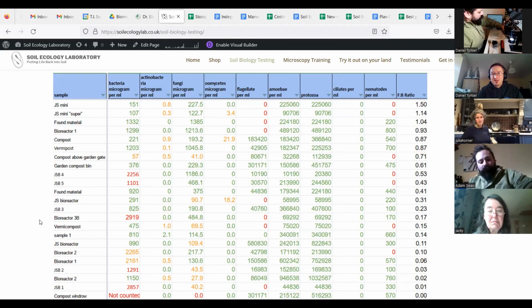And so here, using this microscope method, what we're measuring is that potential. It's not a direct calculation. It's not something that you can easily calculate and say that if you have this amount, that amount of nutrients is going to be released, because you're not going to be able to measure with very specific laboratory equipment the exact knowledge of every plant doing everything, because they're doing it whenever they need to do it.